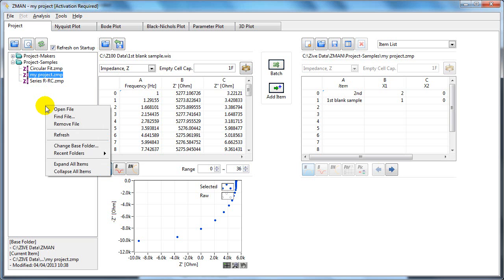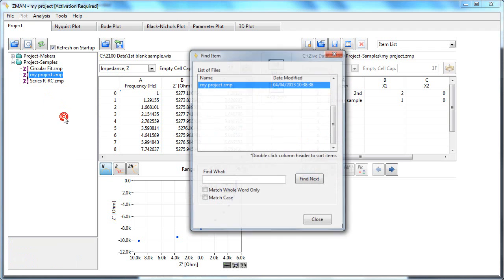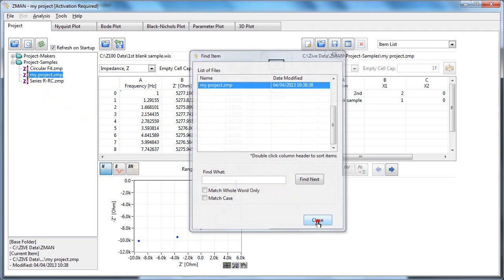If you right click in the data file section, you have some options here. If you have many files, you can use this find file option to find your file.